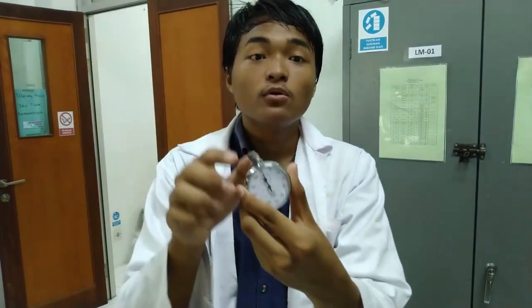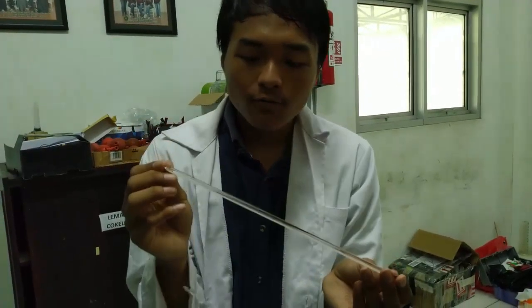Ini adalah stopwatch yang digunakan untuk mengukur waktu yang diperlukan hingga tabung soklet penuh. Stopwatch dinyalakan saat cairan mulai mengisi dan dihentikan saat cairan turun kembali. Ini adalah termometer yang digunakan untuk mengukur suhu di labu, kira-kira nanti sekitar suhu 70 hingga 80 derajat agar pelarut bisa bekerja.